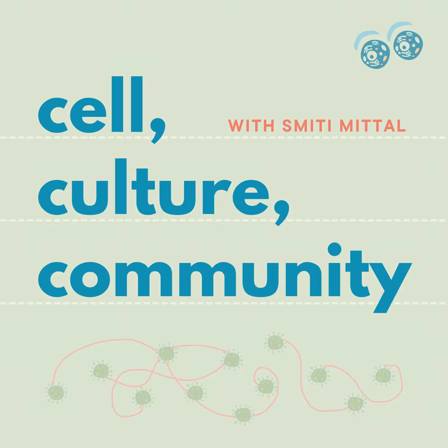And also, less reagent means that you can make a tiny miniature device on which you can organize all your lab activities. This is known as lab on a chip. So the entire processing lab, which could have all the elements a well-resourced biochemistry lab requires, is condensed into a small unit, not literally a chip, but maybe a small tabletop or a credit card type of unit. There you drop the blood, you may have reagents, the blood will react with the reagents, and there may be a change in color.